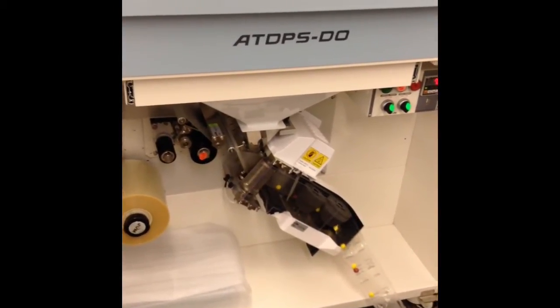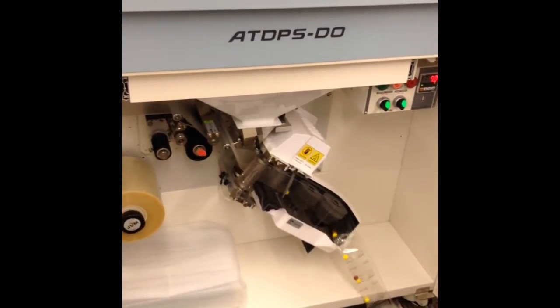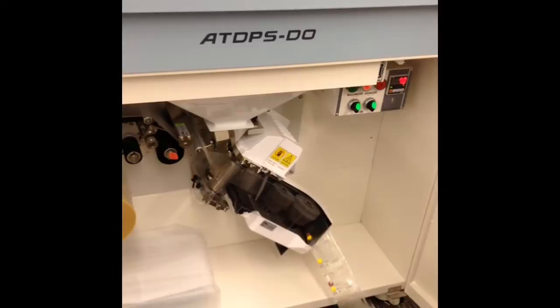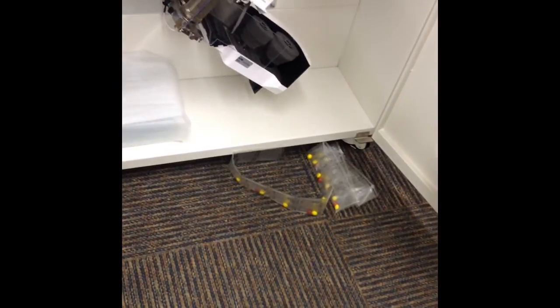So when you enter all the prescription information in, that's what prints out on the label. It'll actually pull the interface over from our pharmacy software, shoot it over, and so it knows what time every dose is supposed to be and what the label information is supposed to be on there. And then when you hit go, it just starts filling.